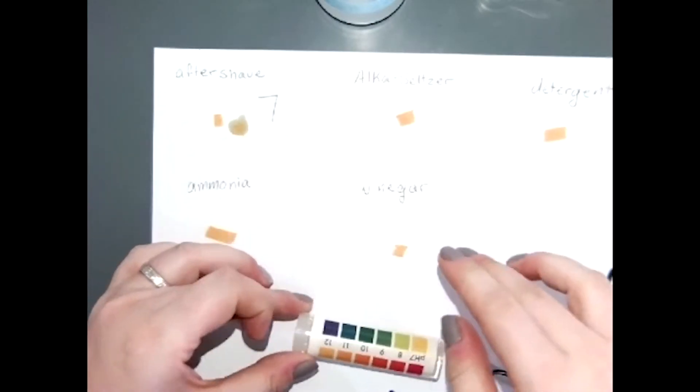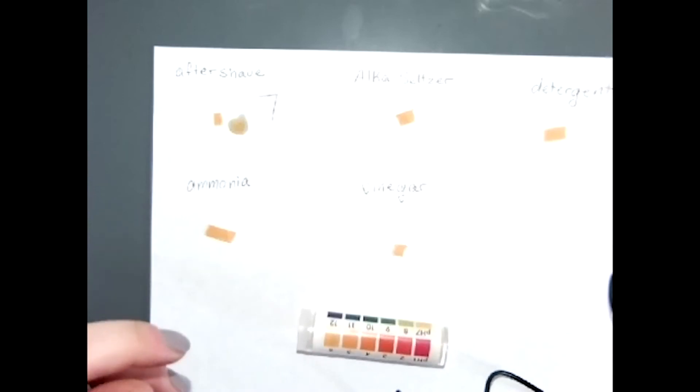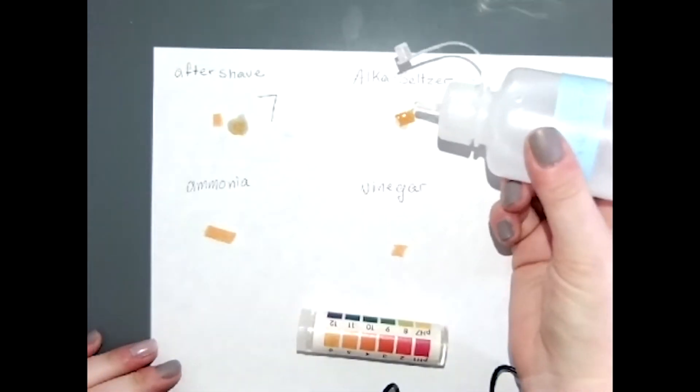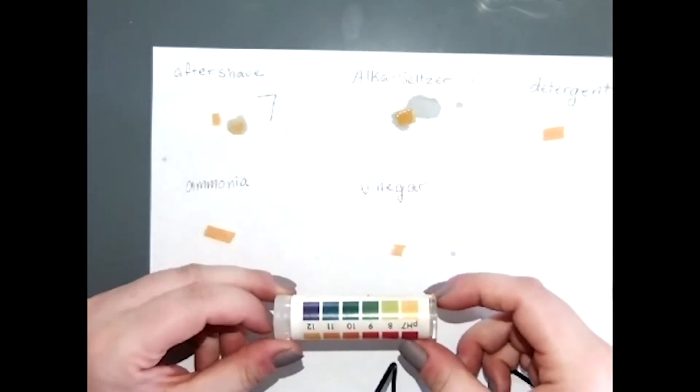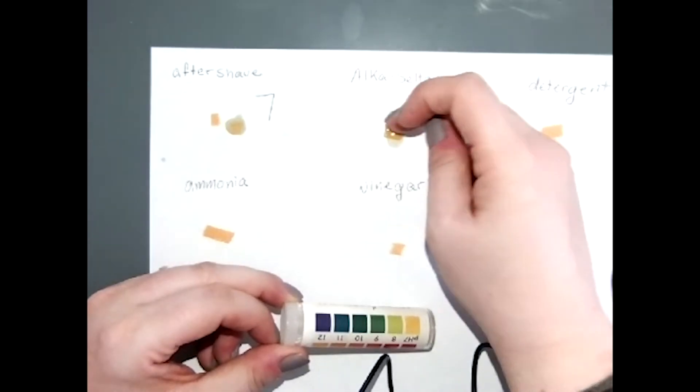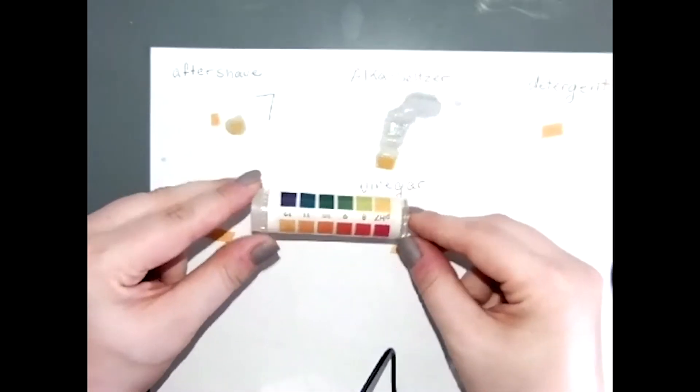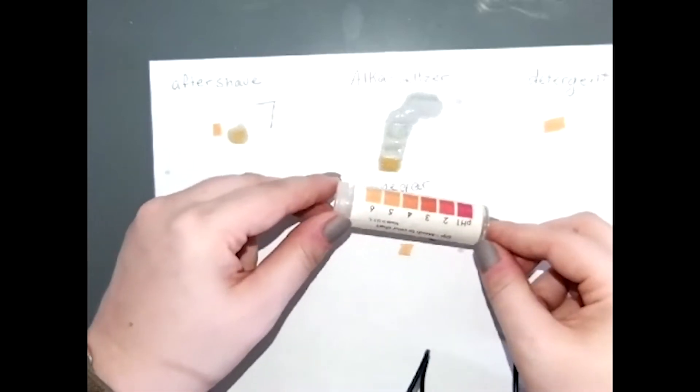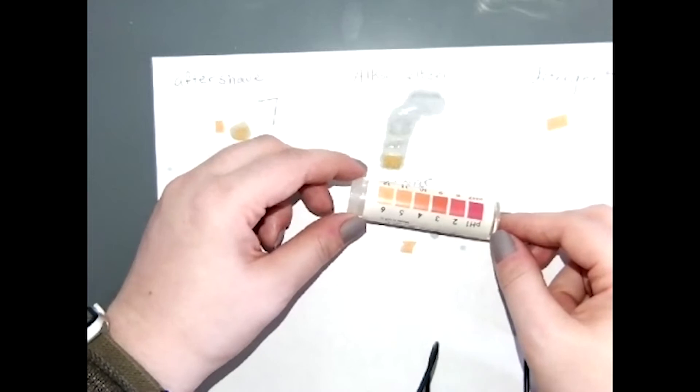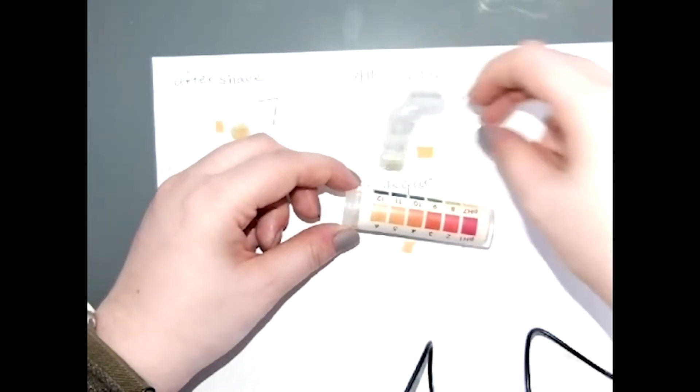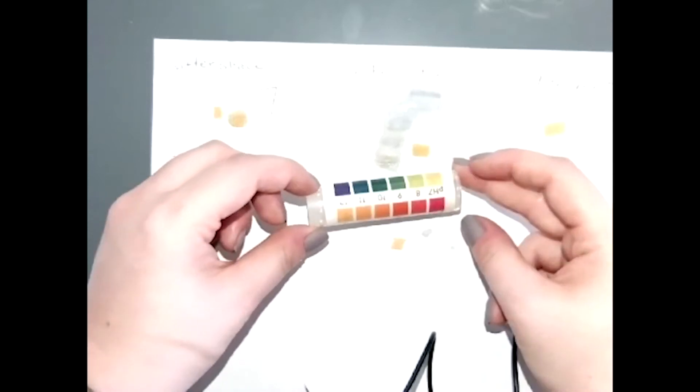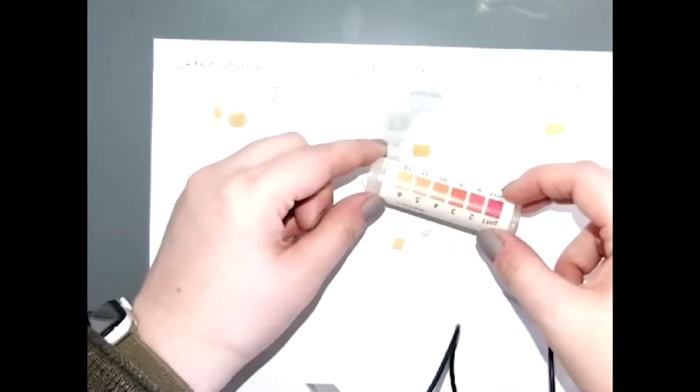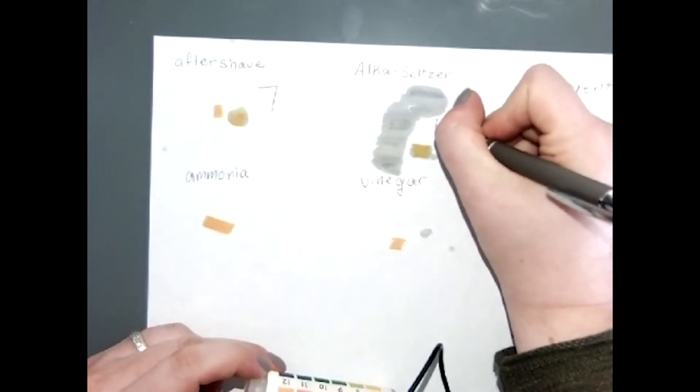Next we have our alka-seltzer. It's very foamy. Place a few drops on the paper. Let's say that that's somewhere between a six and a seven, so we'll call that six and a half.